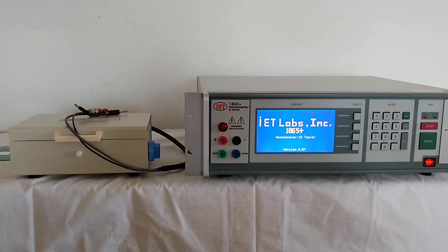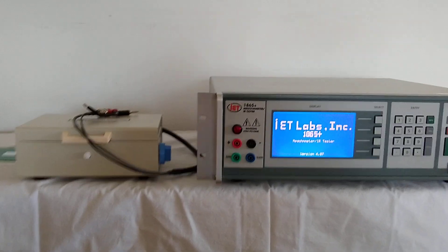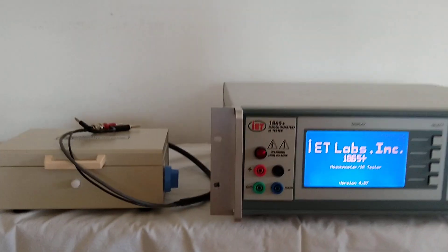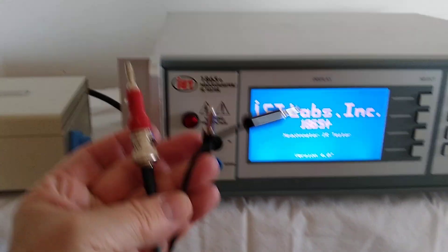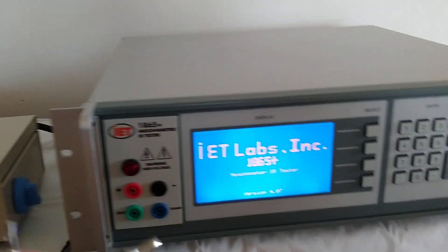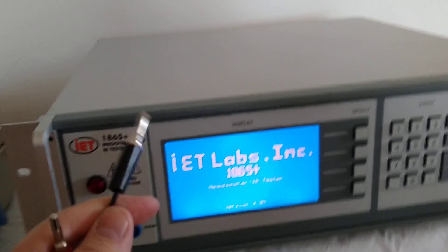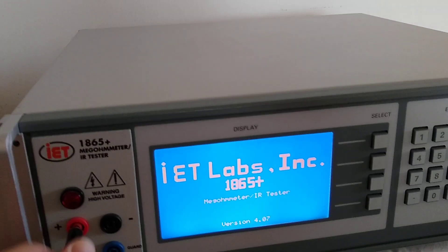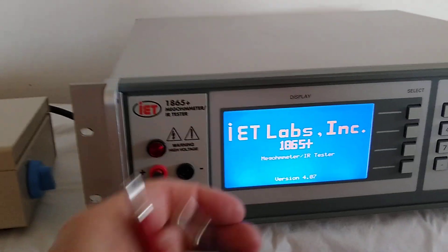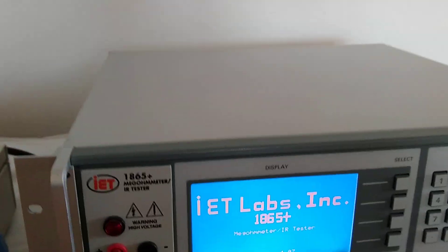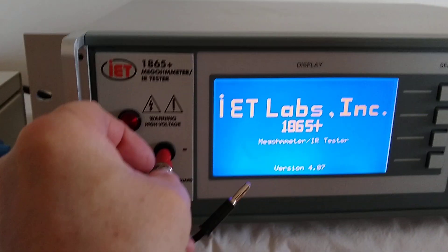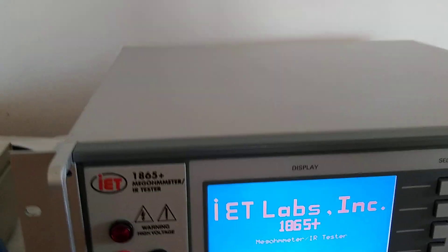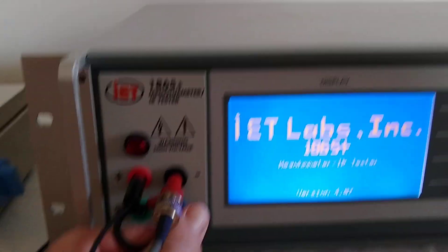In terms of connecting the 1865-11 to the 1865 Plus, it comes with these connectors here. The black connector here goes to the positive, the red with the pigtail goes to the negative, and the pigtail goes to guard.